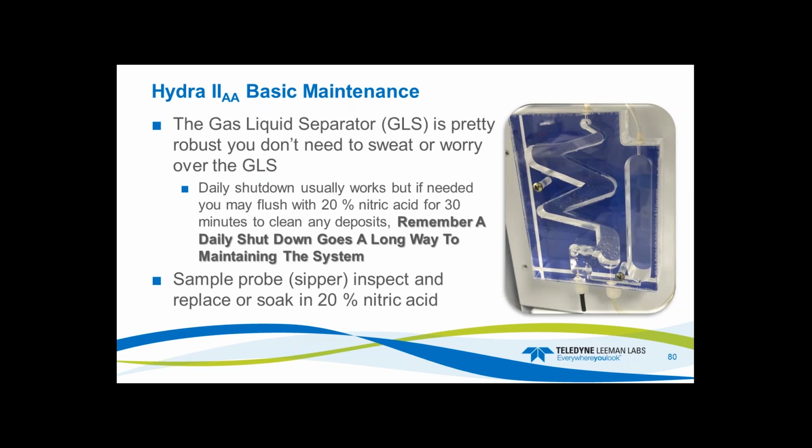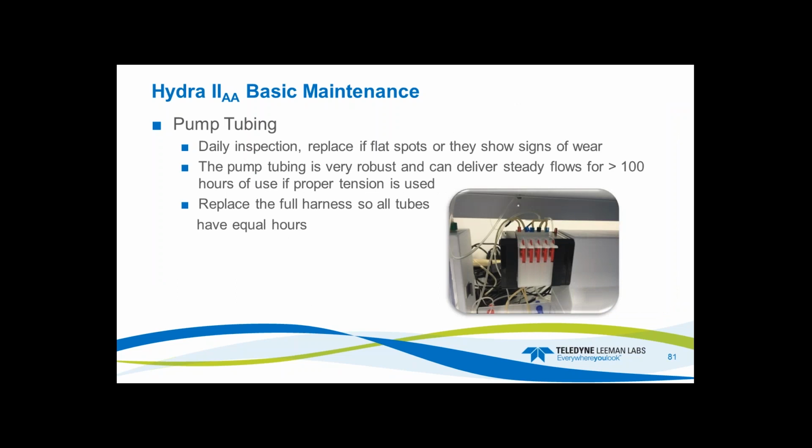Sample probe or the sipper, inspect and replace or soak in 20% nitric acid. There's not a lot of maintenance with the system. It's pretty worry-proof. Pump tubing, you're going to inspect that daily. If it shows signs of wear, just replace them all. If the tension is set properly, the pump tubing should last for greater than 100 hours of use.